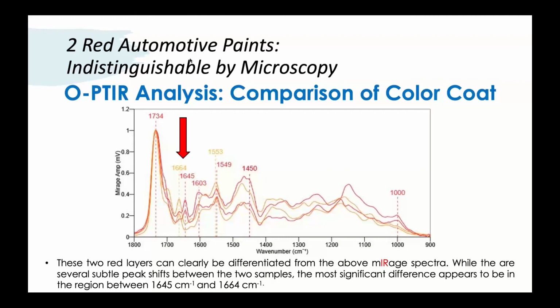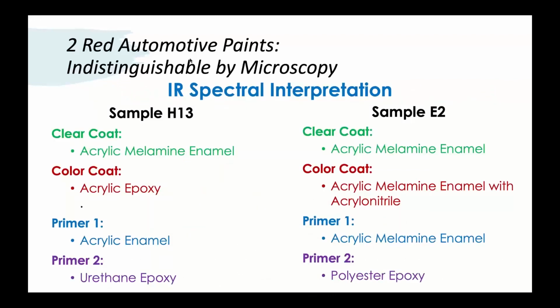It's an automotive paint database originated and housed at the Canadian Royal Mounted Police. And forensic labs can submit paint samples to them for analysis and identification of potential cars or vehicles that might have that paint structure. So it's used to create investigative leads in vehicular accidents and hit and runs. Now, for the PDQ, you still have to input the data or the interpretation and the type of paint for each of the layers.